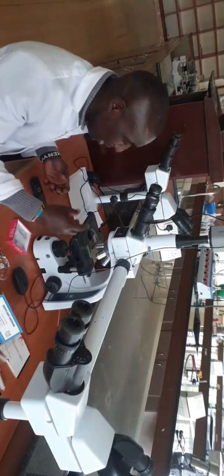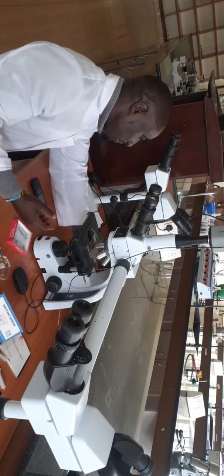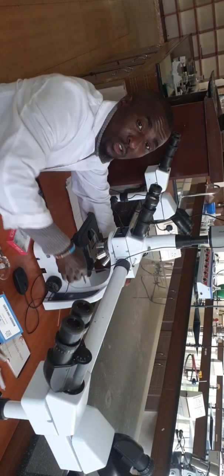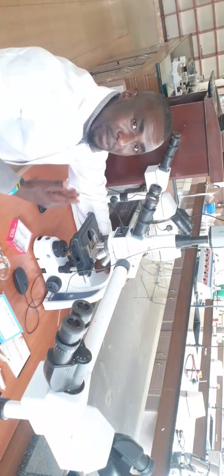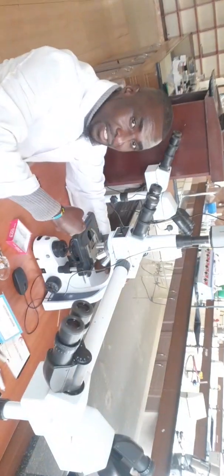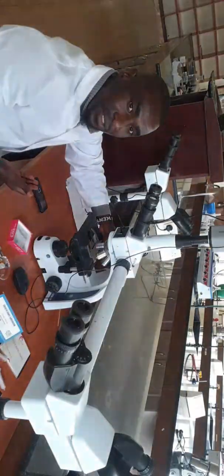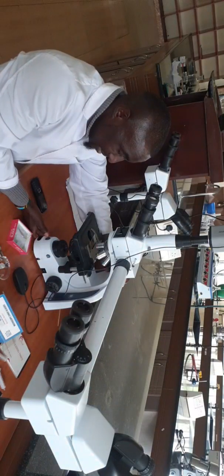Now, the next portion is the arm. This is the arm of the microscope. This is the arm you can use to hold the microscope when you are carrying or transporting the microscope to the next bench in the lab. You have to carry it by holding the arm, this part, the arm and the base. So you carry it by the arm and the base, then transfer it to the next bench.